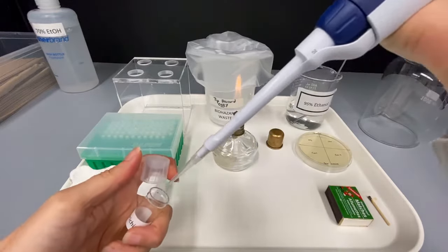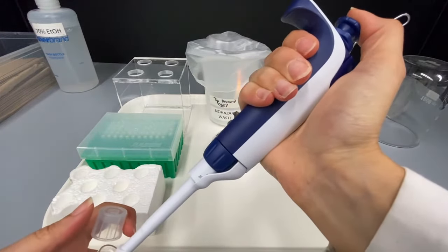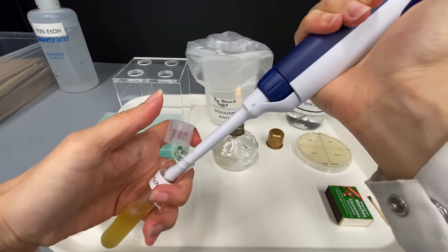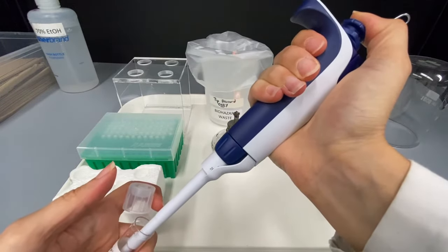Remove the cap, push the pipette plunger down to the first stop, put the tip into the solution and slowly release the plunger to pick up the liquid.